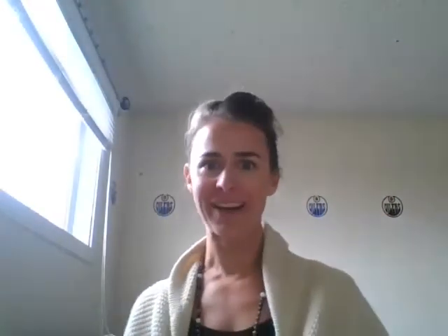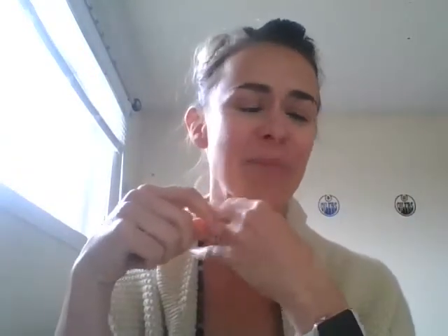I am so sorry. The first recording, I guess, had no sound. So I will try to do my best to remember what I said this morning. I am going to leave the muted video on just because it did have the process on it where I added the chemicals. So you can just look at that when you get to that part. But I will redo the thing.